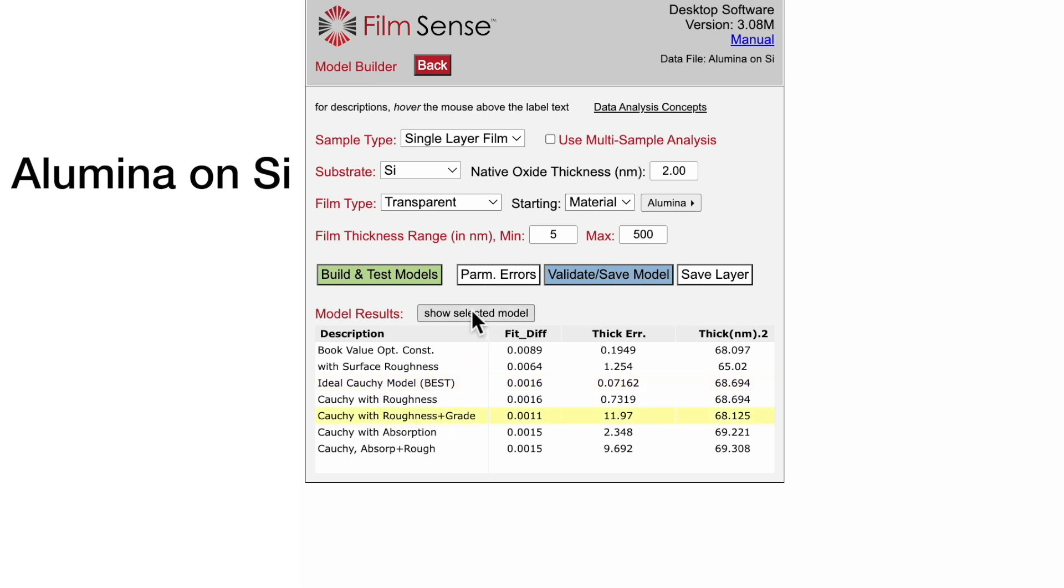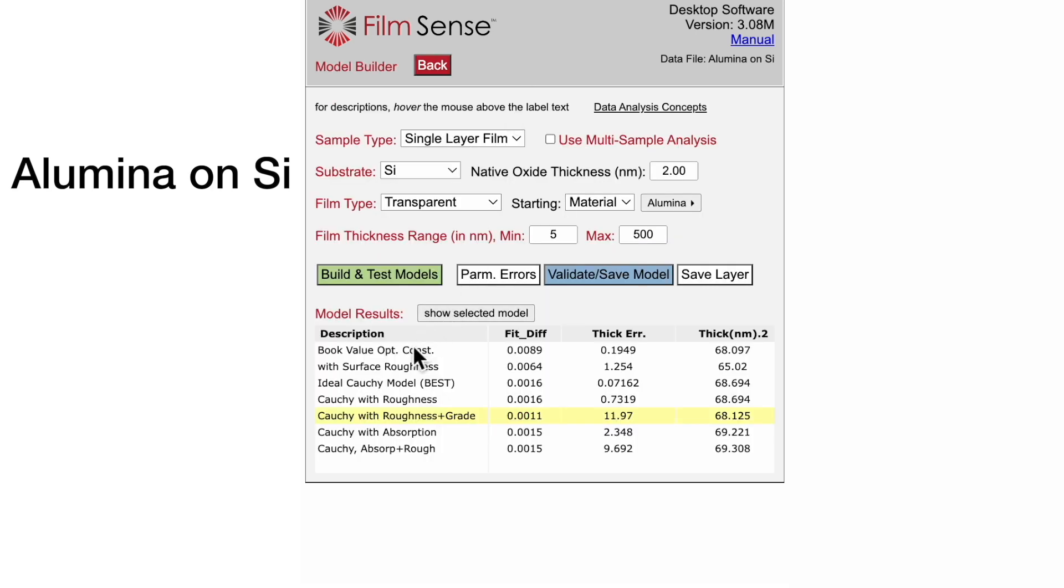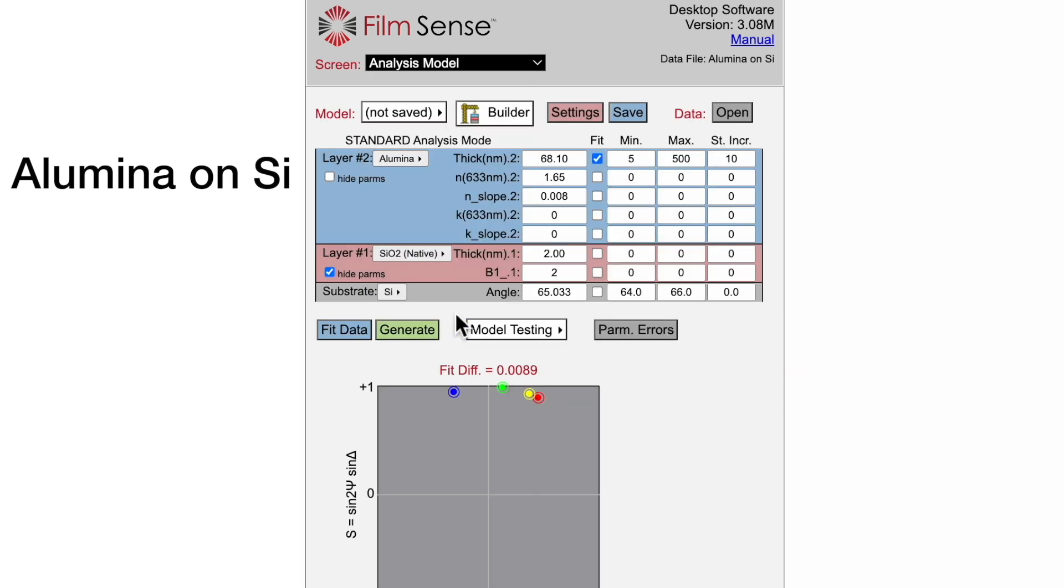Click the show selected model to see how the model was constructed. Here is the more complex model with roughness and grading, and here is the ideal model using book value optical constants and fitting only for the film thickness.